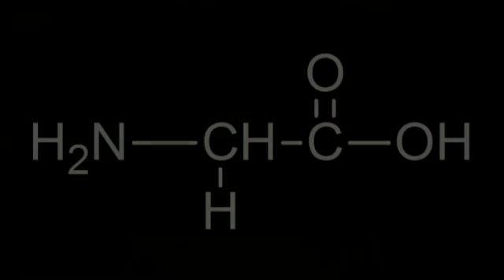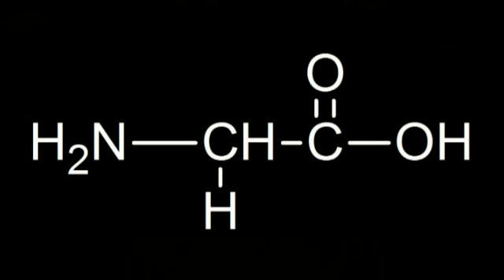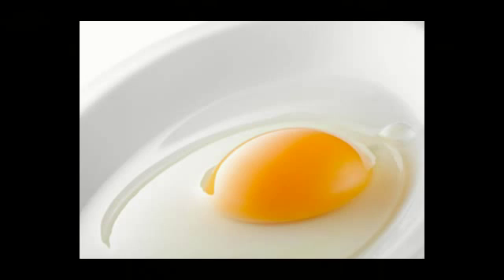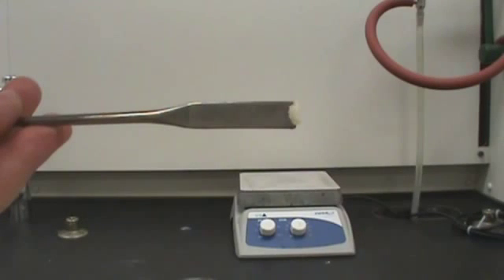Part 2 of this lab tests for different characteristics of your casein using the Biuret Test, Ninhydrin Test, and Xanthoproteic Test. In all three tests, you will be testing your casein against glycine, a nonpolar amino acid, tyrosine, a neutral polar amino acid, and egg albumin, a protein commonly called egg white. In all three parts, you will only need a small amount of the casein as shown.